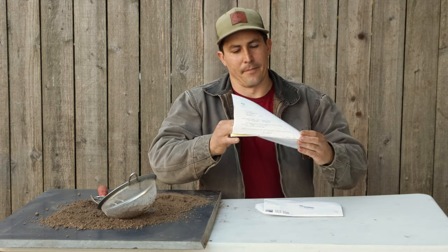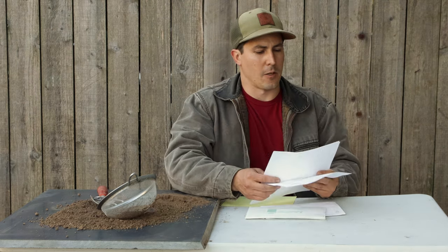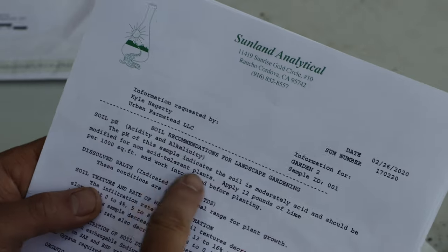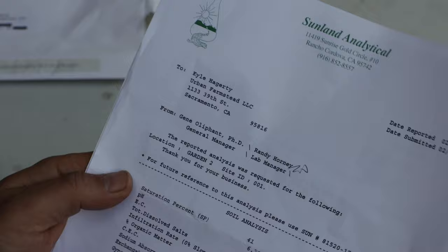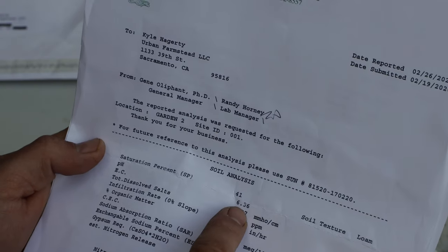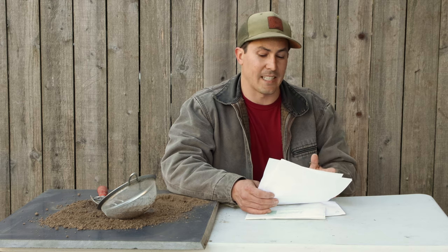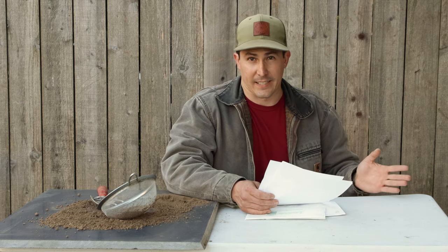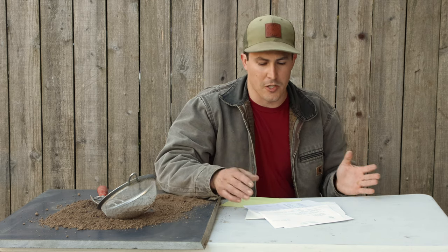I'm really excited to see what the lab analysis says. The first part talks about my soil pH and says my soil is moderately acidic — pretty much what I found from both of those kits. It says my pH is 6.36, which is almost exactly between the two test kit readings. Those were both based on color guides so they weren't completely accurate, but this is consistent with what I've been finding on my other two kits as far as pH.